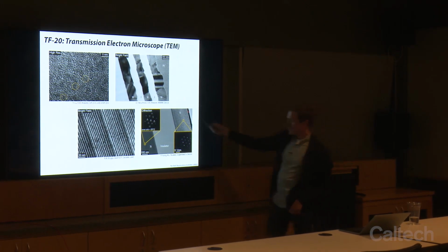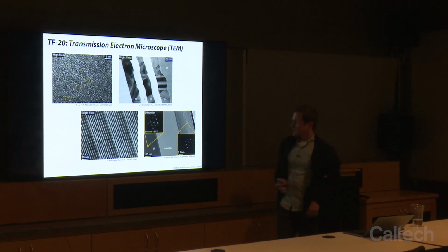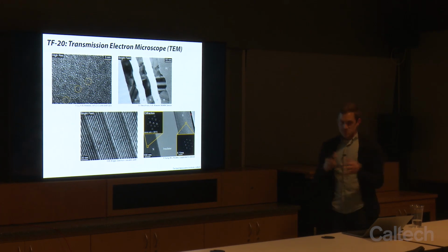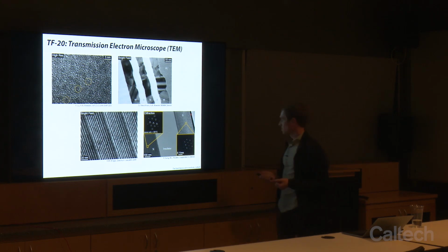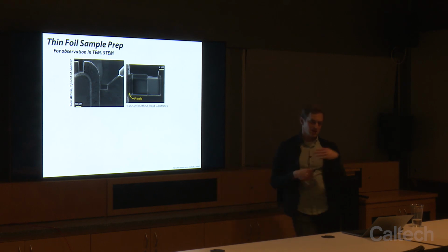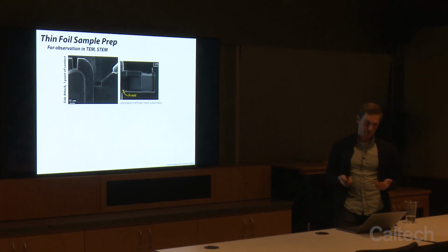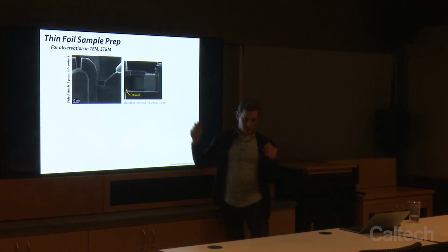And then, of course, you could do diffraction studies in a TEM where you can analyze the crystallinity of your sample, what crystal planes you have, and what the spacing of your lattice is, and that's all done through electron diffraction. And what I'll go through in the next lecture on gallium FIB, and a little bit later on helium FIB, is how we can make these samples. So we want to extract a very thin sample. That's how you do TEM.